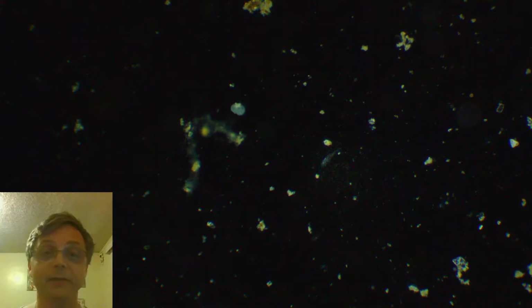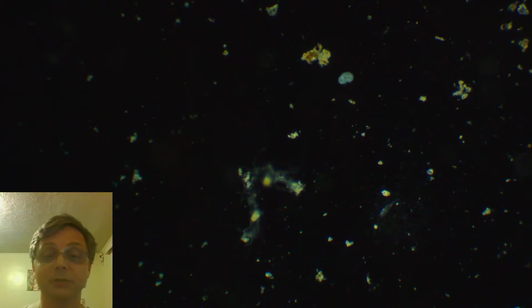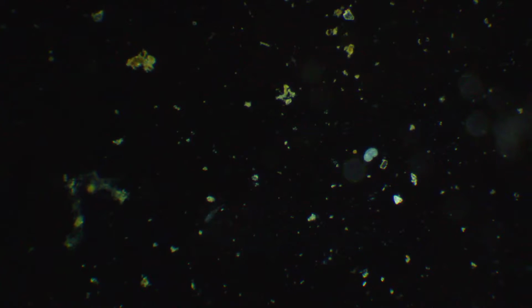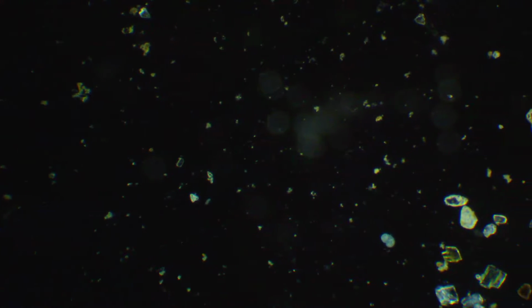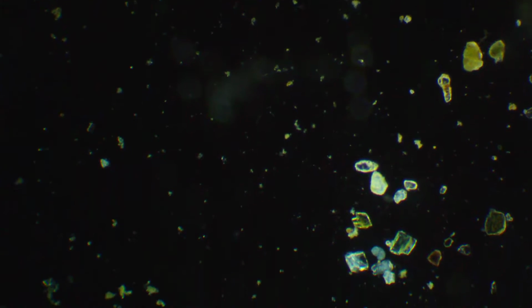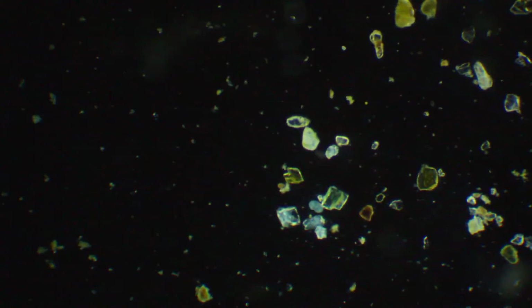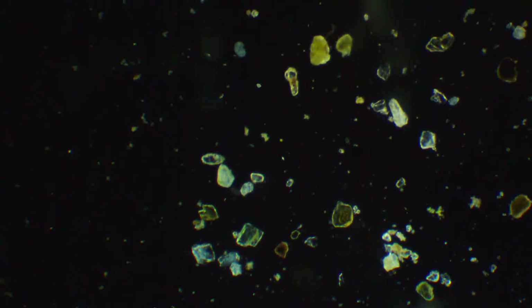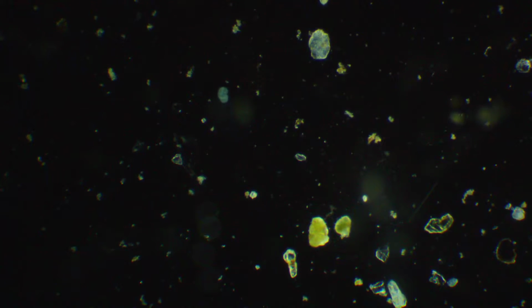Oh, hey, look, a lumpy thing. There you go, little lumpy guy. I'm just going to take myself off here and put the lumpy thing on for a second. Just follow him around for a minute. There goes a paramecium. Those ones I usually don't try to follow, they're too fast. They're not as slow as these guys. These are about the fastest thing that I want to try to track.